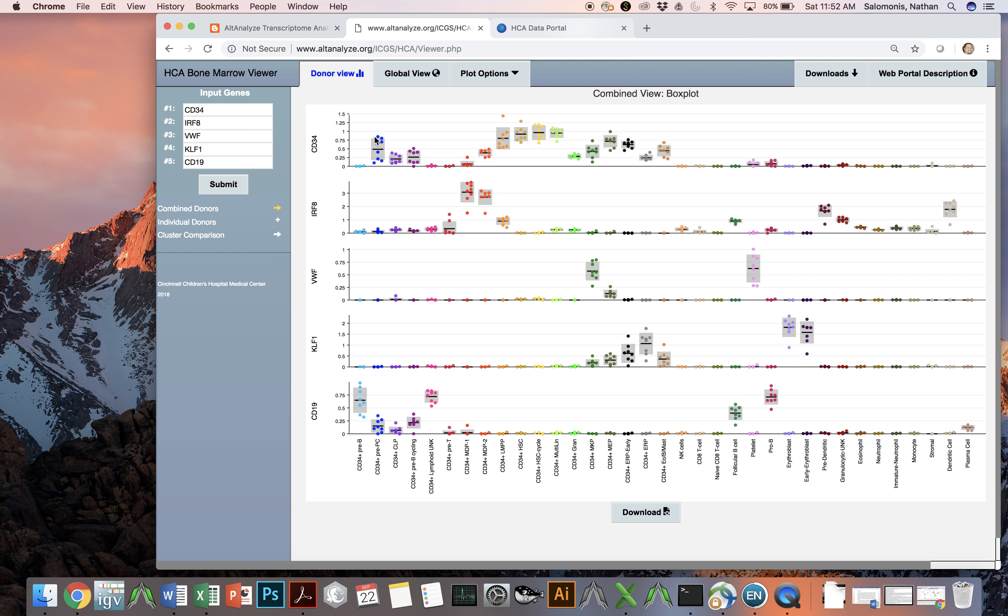Each one of these dots represents a different individual, as you can see here. When you mouse over each individual cell, you'll see that it indicates the donor, who the donor is, their age, and their gender.